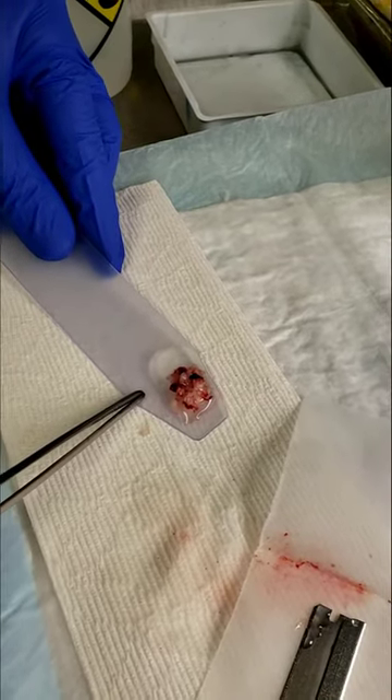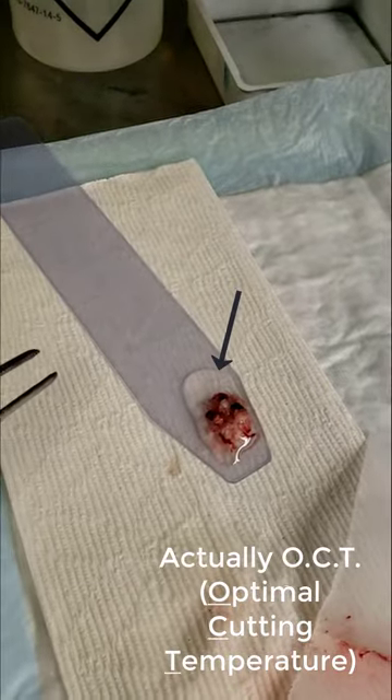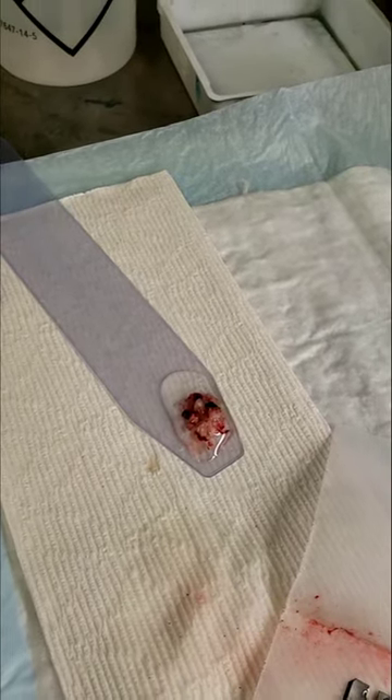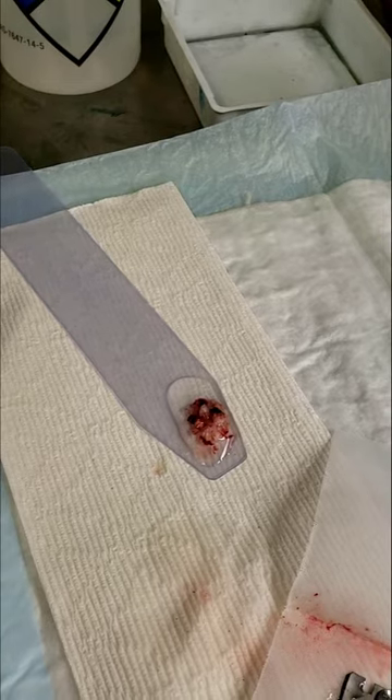Then we put it in this media called OCT — it's the clear stuff that's sort of around this tissue glob. That's going to allow us to have something that will freeze up very quickly so we can look at it histologically.